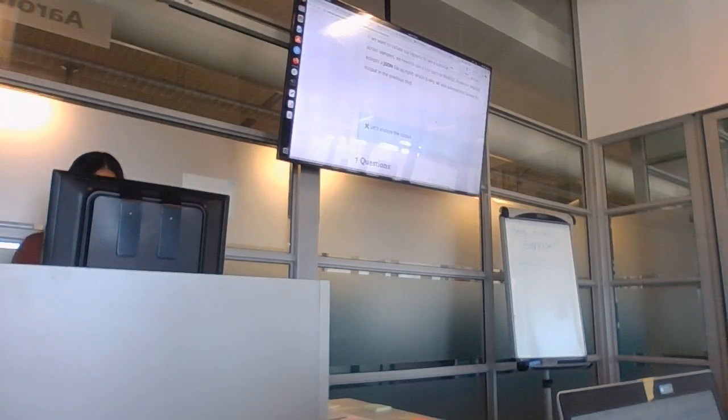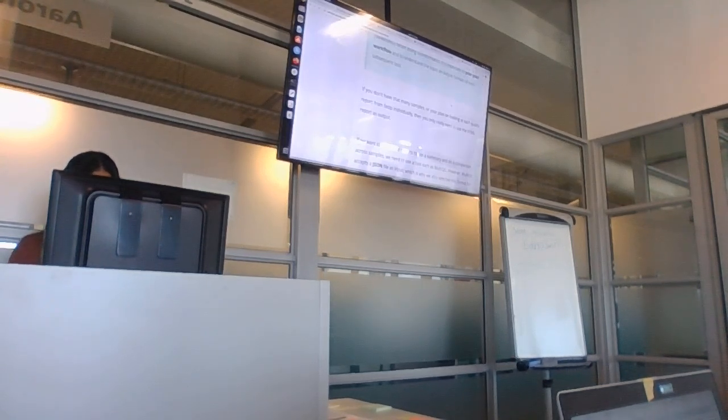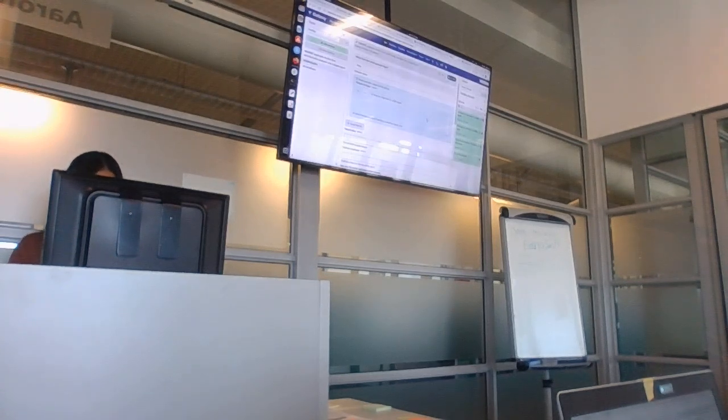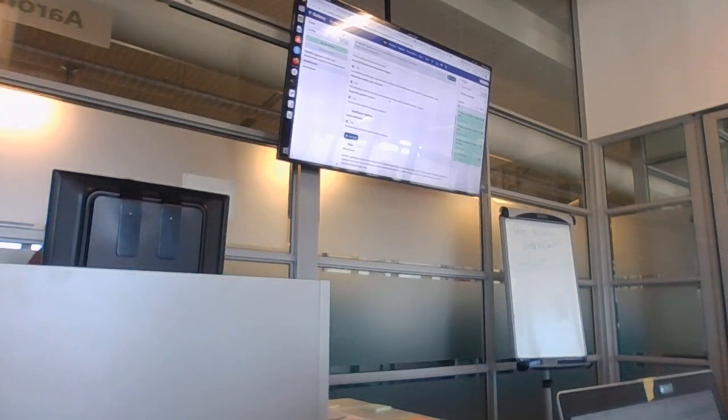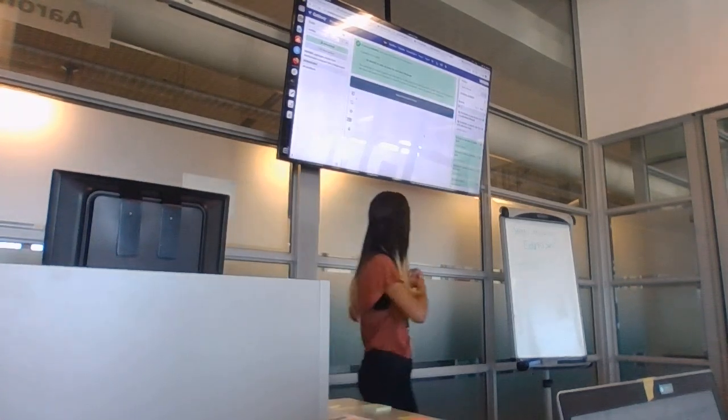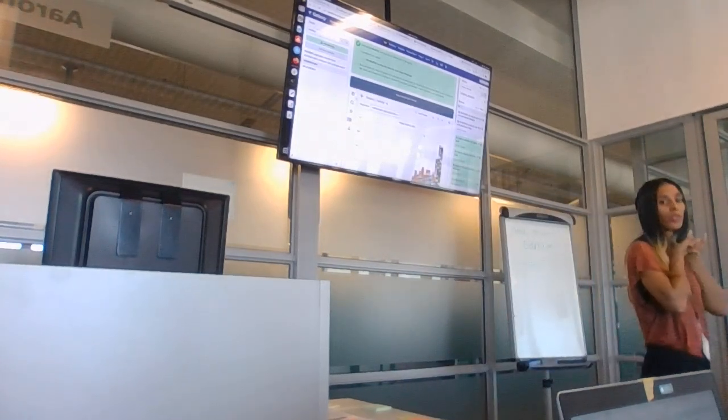Again, I'm just following the tutorial here. I see I actually didn't write about MultiQC, I should add that. Okay, so you don't need to add anything else. Run the tool. And then try and see if you can answer those questions.